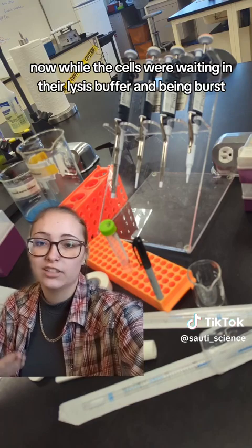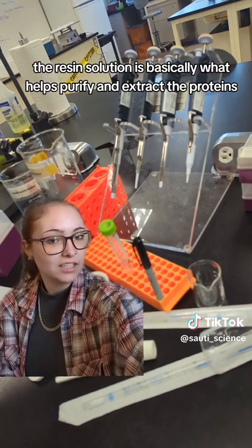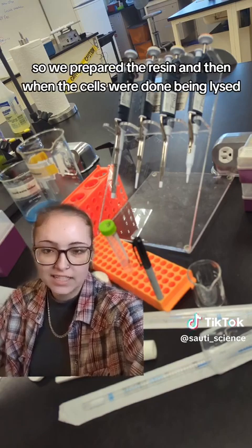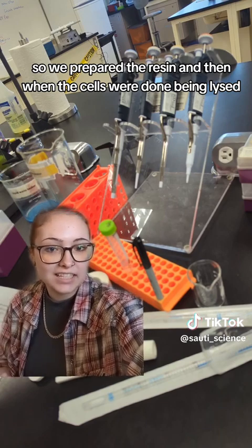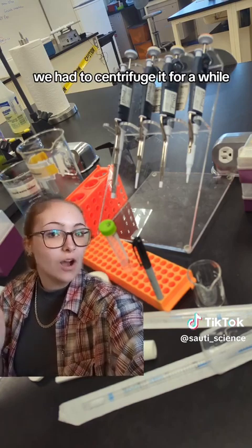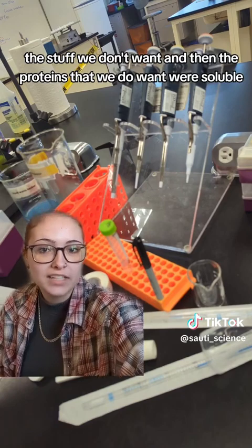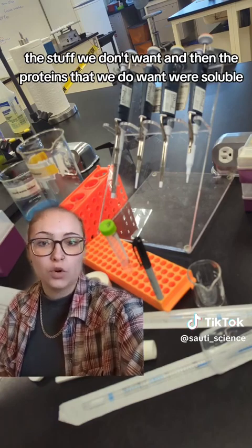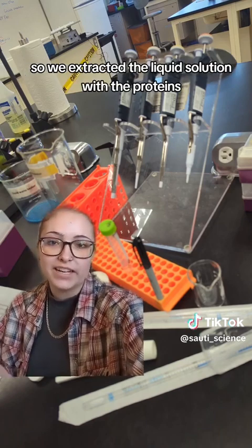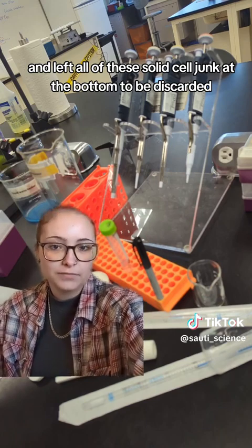While the cells were waiting in their lysis buffer and being burst, we had to prepare a resin solution. The resin solution is basically what helps purify and extract the proteins. When the cells were done being lysed, we centrifuged everything to collect all of the solid junk at the bottom — the stuff we don't want. The proteins we do want were soluble, so they were in the solution left over, which we extracted and kept.